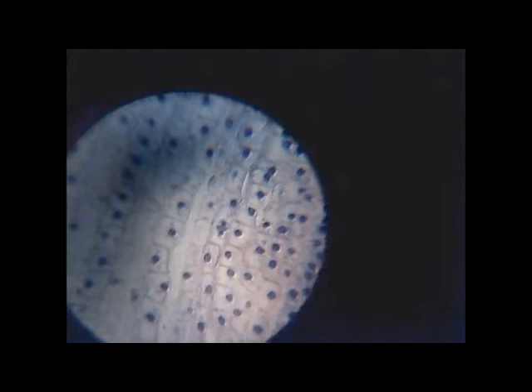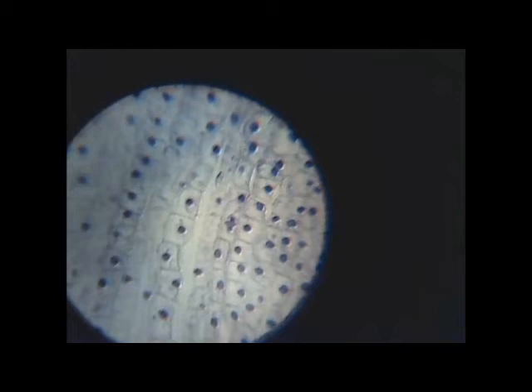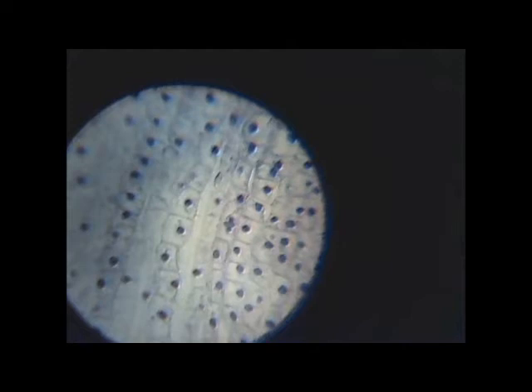Next time I'm going to show you how to measure the size of these cells using a simple technique — like using a ruler — and then we're going to calibrate and standardize it under the microscope. That way we'll know, for example, under low, medium, and high power what the size of objects like a cell would be.